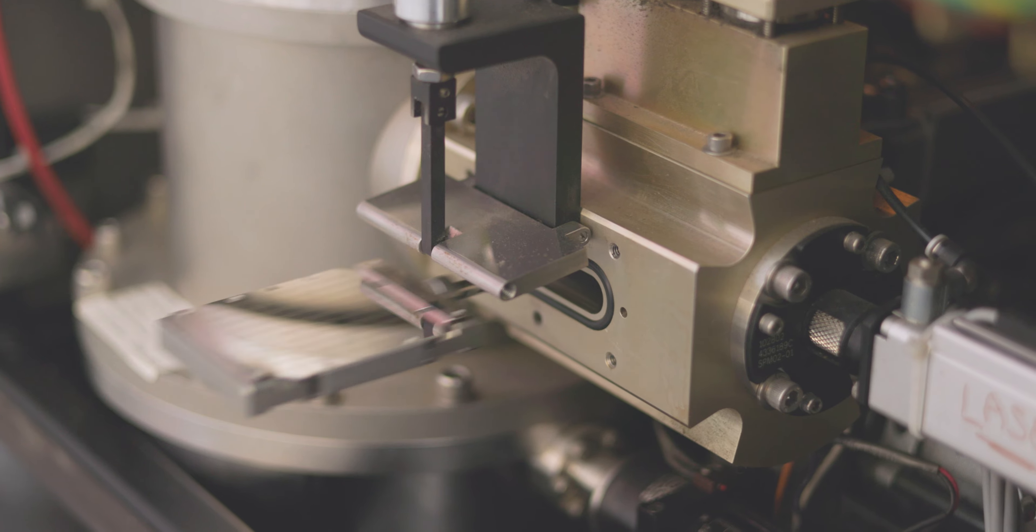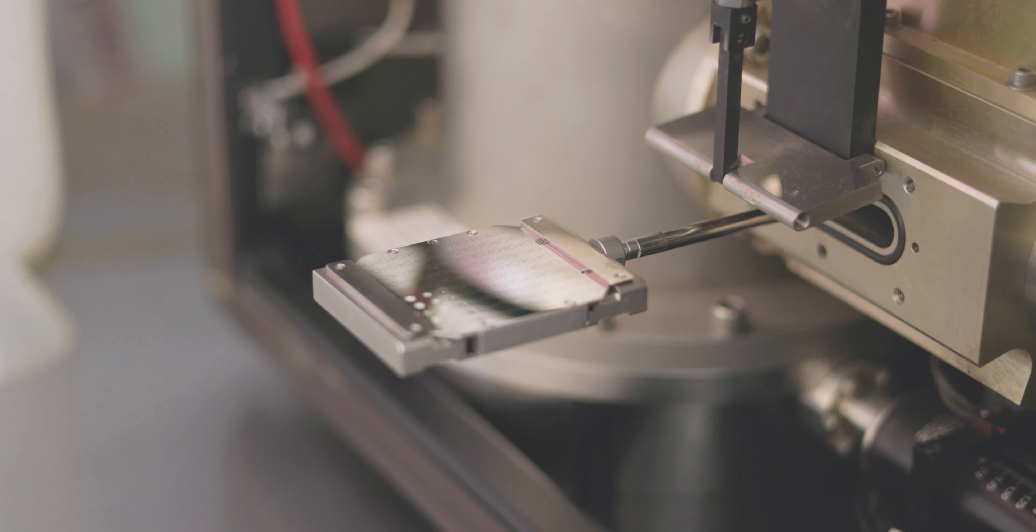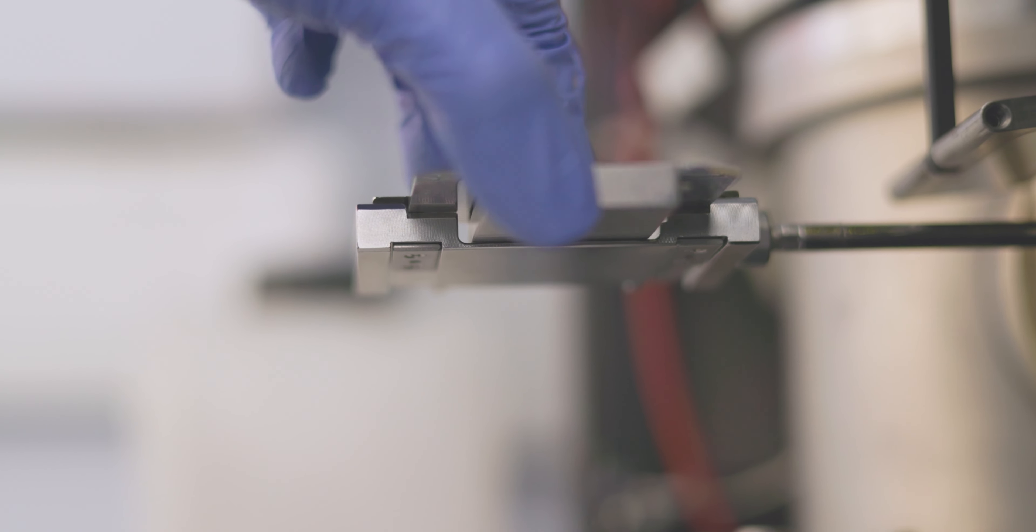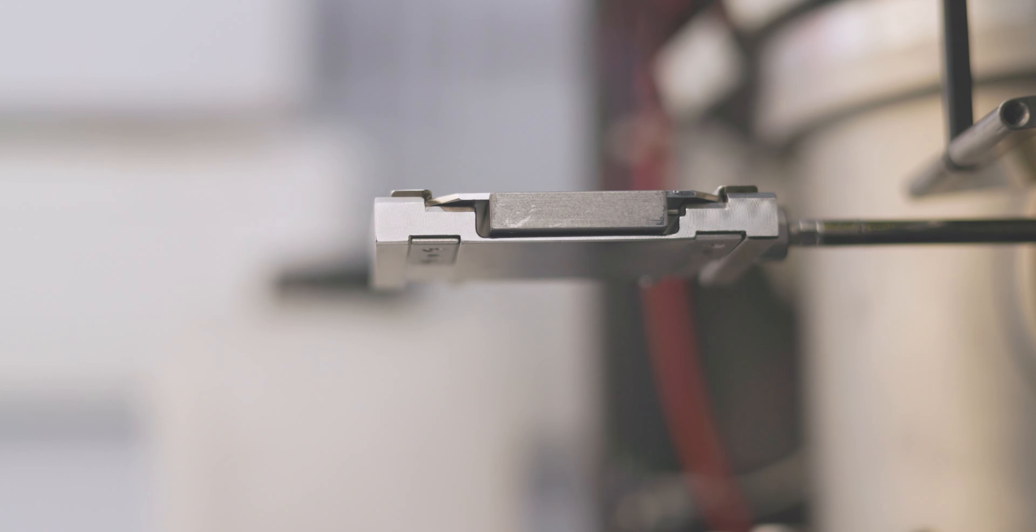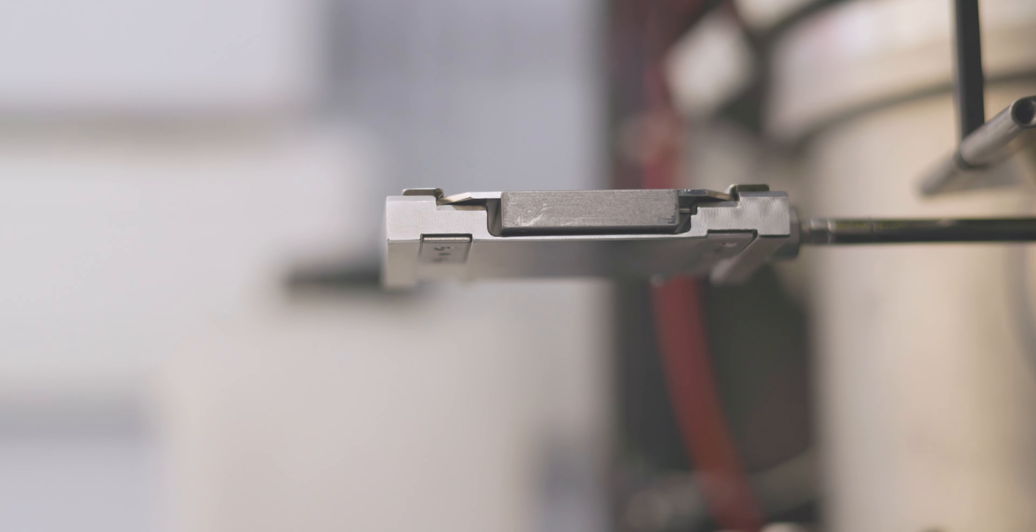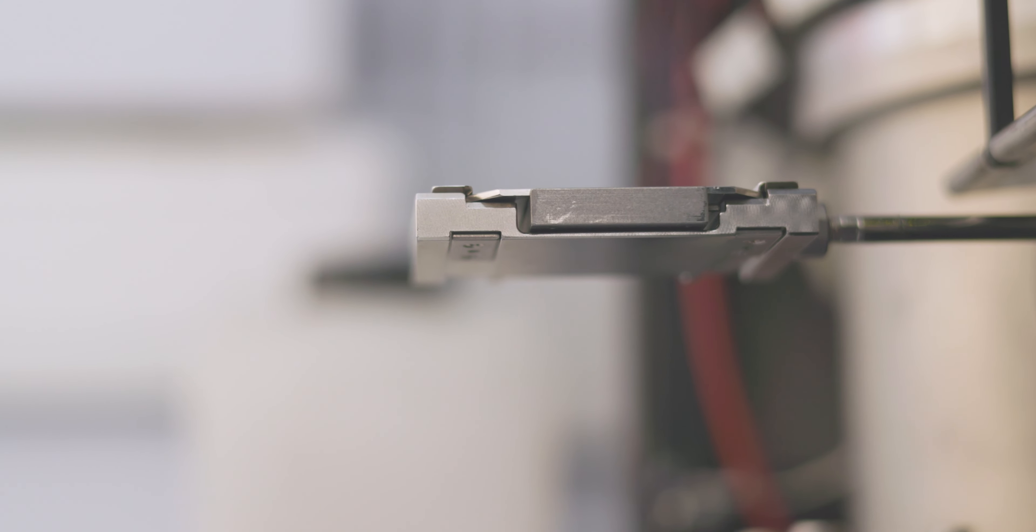We eject the old plate from the machine, the last run sample, and slide in our new plate. This goes into the mass spectrometer, and then it's put under a high vacuum.